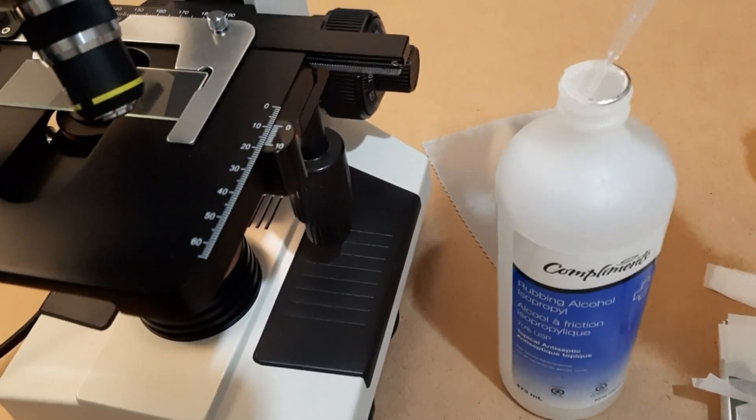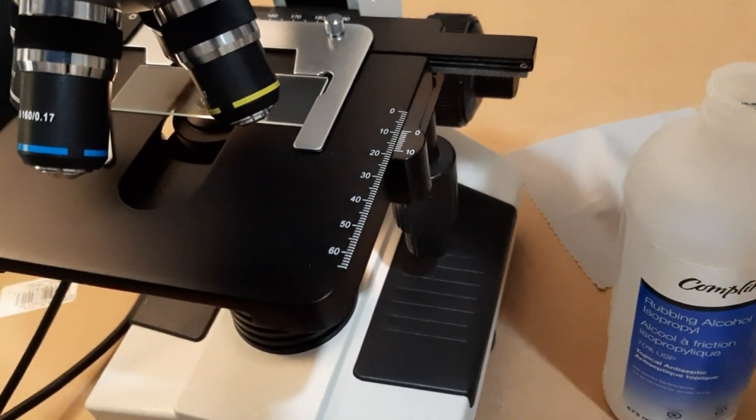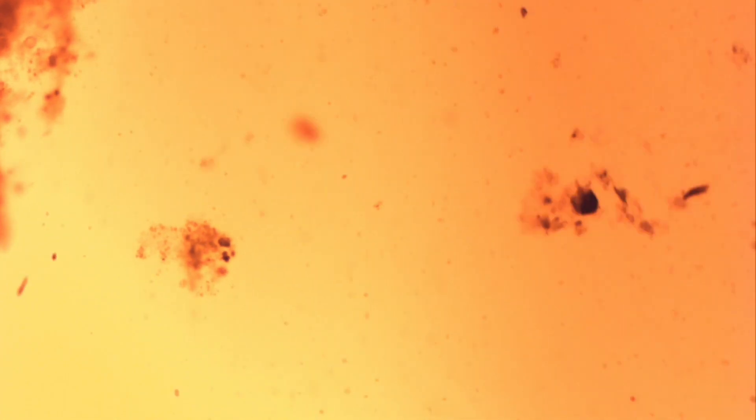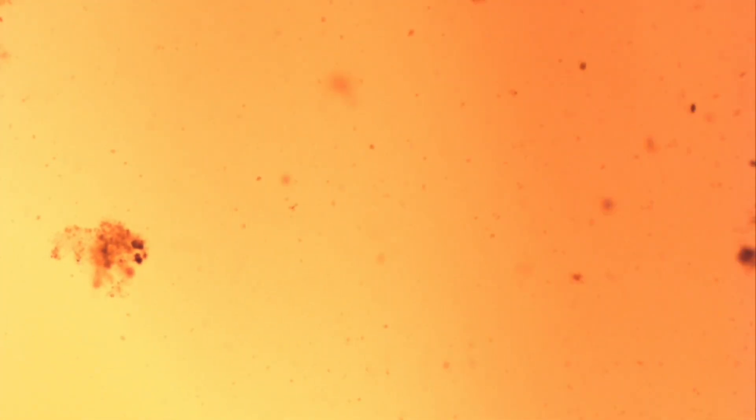Next I try pure alcohol. This is isopropyl alcohol, whereas the active ingredient in sanitizer is ethyl alcohol, but they work more or less the same. This completely changed the viscosity and created massive currents. We didn't get to see very much, but the effects were very dramatic.